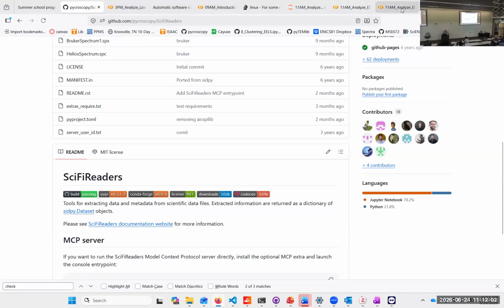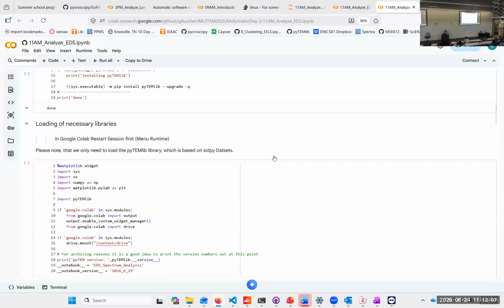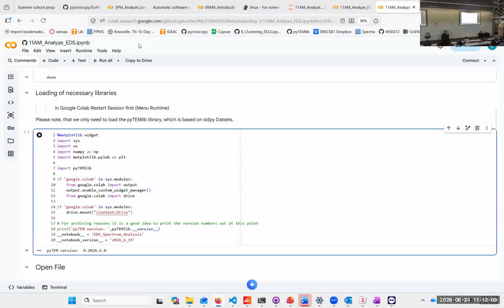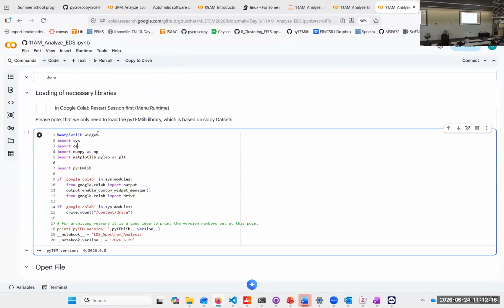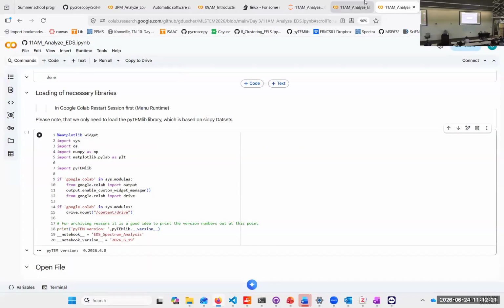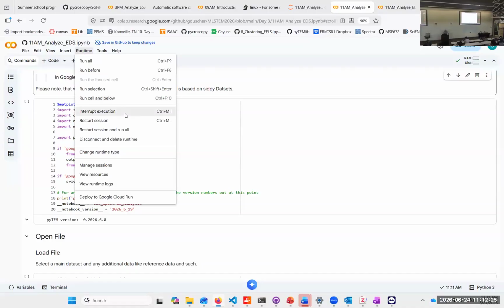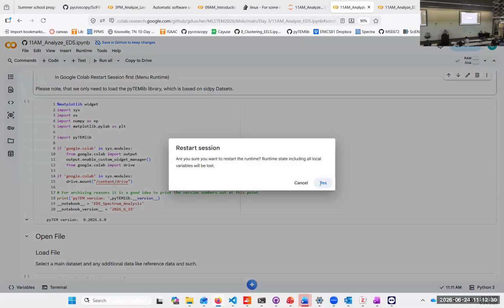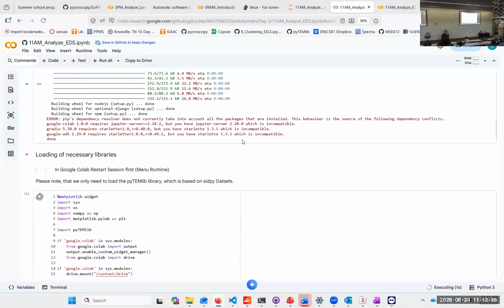And so now while I bridge that, we are done. We have to restart our runtime. Oh, okay, we don't need to restart it. Yeah, it's this one. Okay, here we have to restart the runtime. I have a few of them open. Restart session. Everything stays here. And we can open that now.